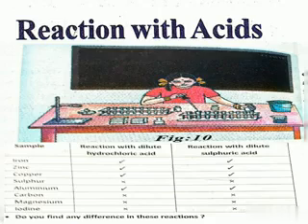After that, we add 5 ml of dilute hydrochloric acid to each test tube with the help of a dropper and observe the reaction. If you do not see any reaction, heat the test tube. If you still see no reaction, add 5 drops of concentrated hydrochloric acid. Next, bring a burning matchstick near the mouth of a test tube, observe what happens, and record your observation.